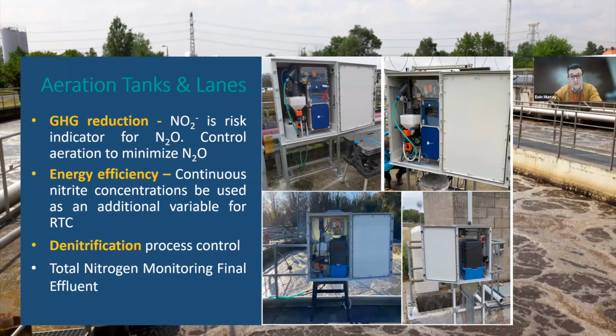And then denitrification as well, which is, I guess, a more clear application in terms of having that real-time nitrite and nitrate information. You understand the status of your denitrification process. So the analyzer is being used for that type of application as well. And then in terms of a very straightforward application, total nitrogen monitoring, customers are using the analyzer for nitrite and nitrate data within their final effluents in terms of discharge and things like that.